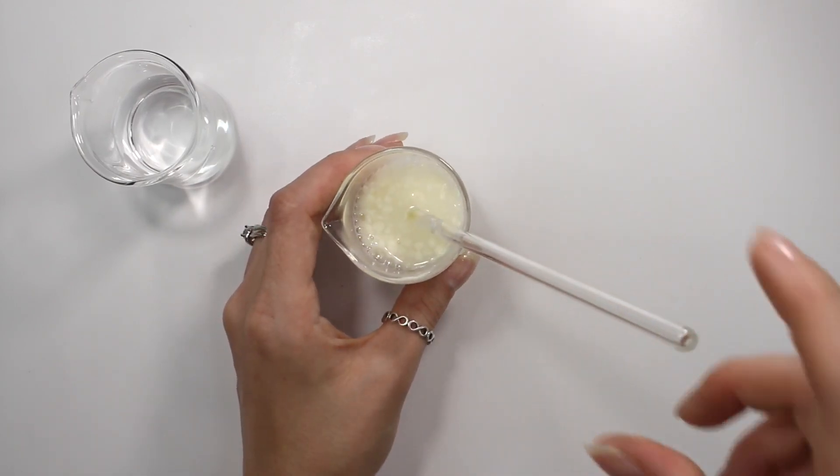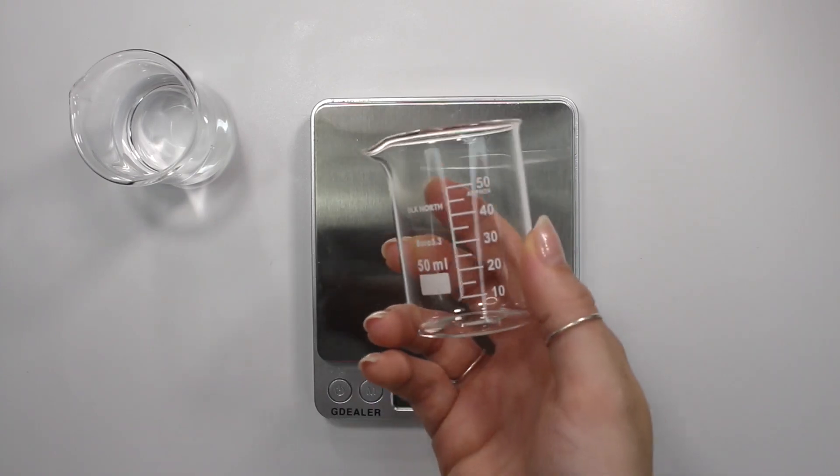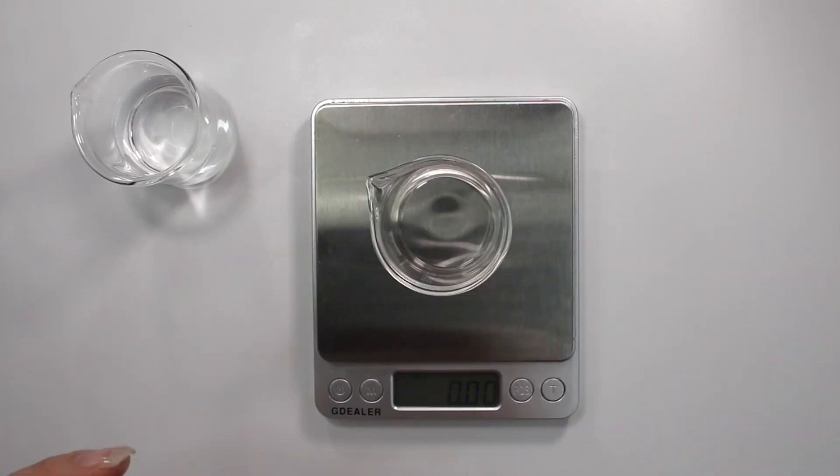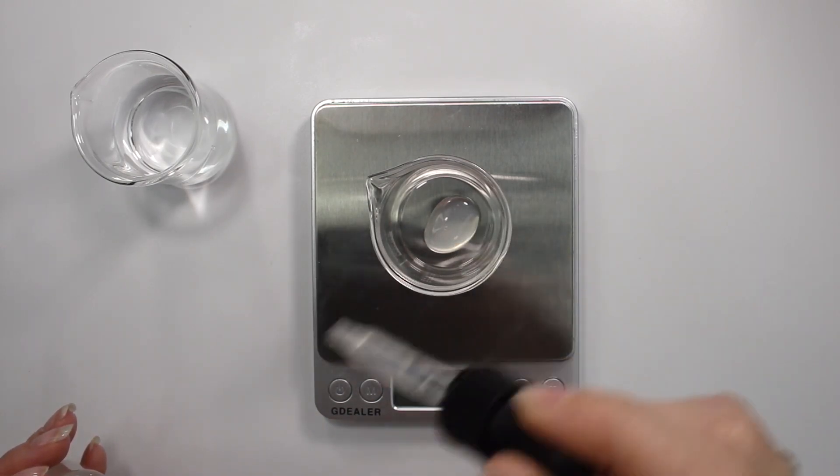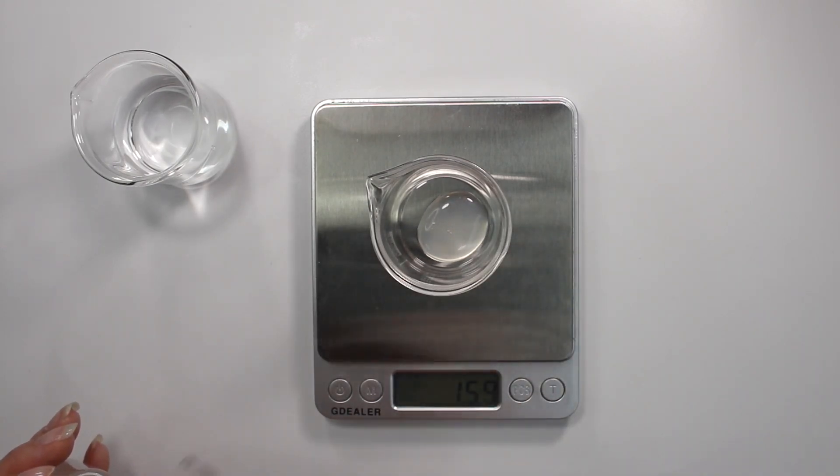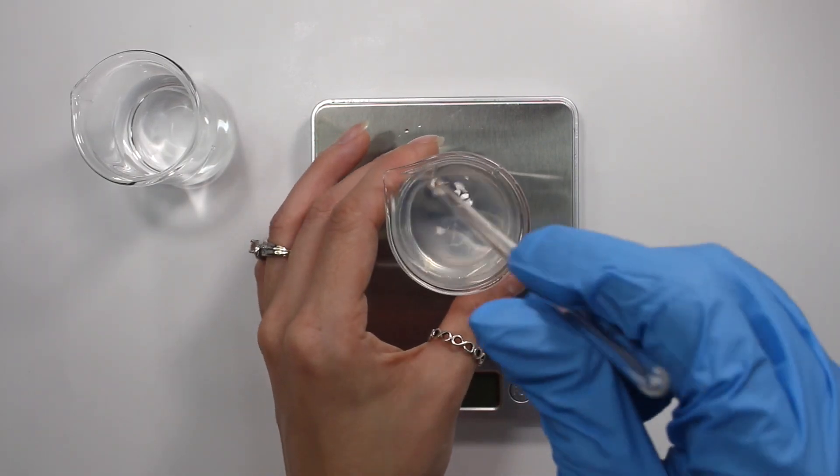So while that is dissolving in the water, I'm going to go ahead and weigh out my serum. And I'm just using a 50 milliliter glass beaker here. I used a 50 milliliter glass beaker for the last one as well. I'm weighing out 10% of my serum and then 90% distilled water and then just mixing that in until it's dissolved.